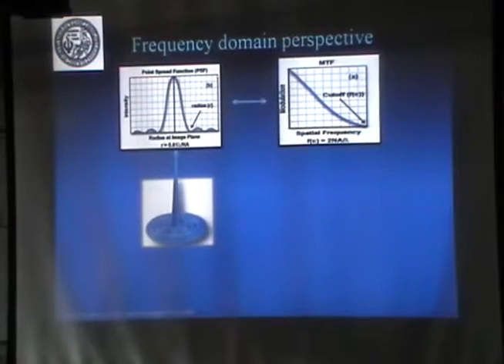We talked about Fourier transforms yesterday. So the Fourier response, as I mentioned yesterday, is just the Fourier transform of this function. If you want to get the response in frequency, you take a Fourier transform of this function, and then take the modulus squared, and you get something like that.